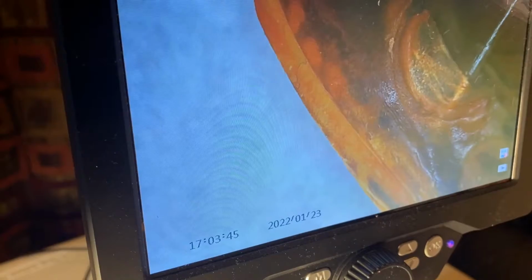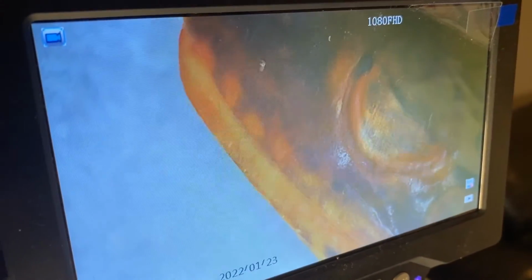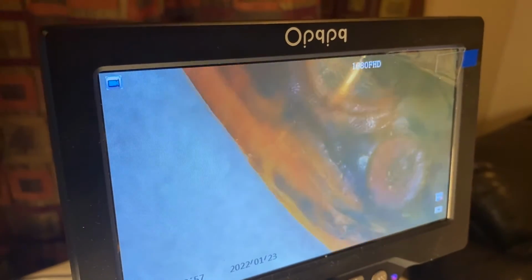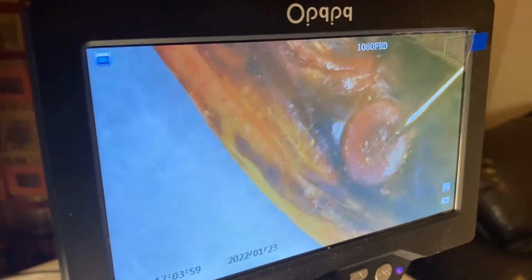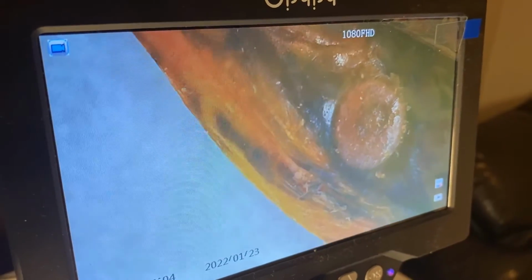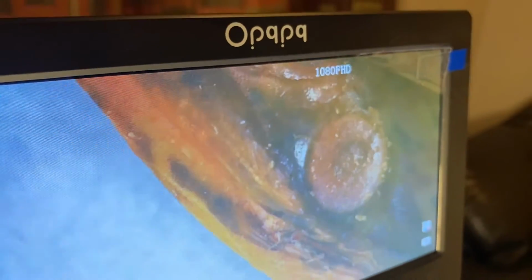This membrane is called the nictitating membrane. When the frog is in water, the nictitating membrane will flip over the eyes to protect them. Directly underneath the nictitating membrane is the tympanum, the circular structure. The tympanum is the eardrum of the frog. It's how it hears.